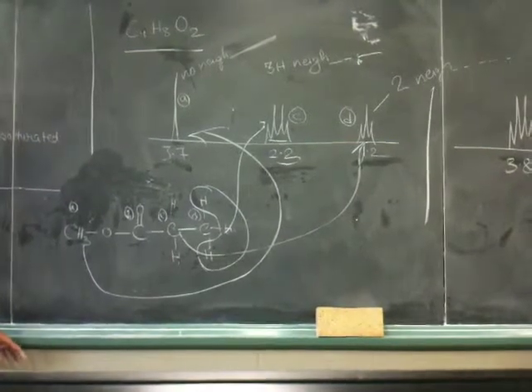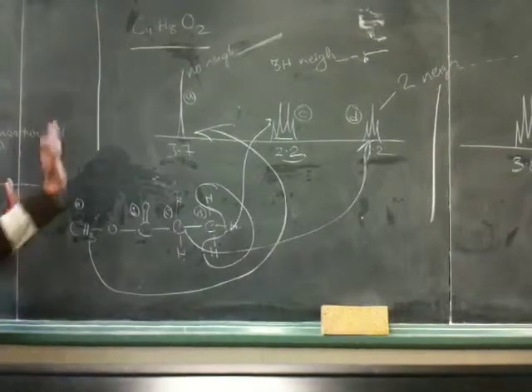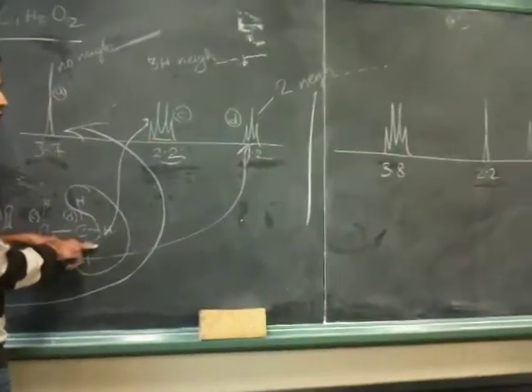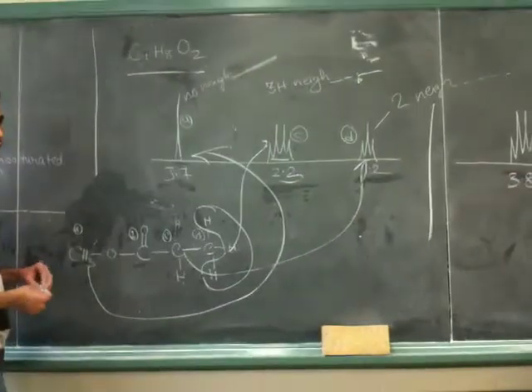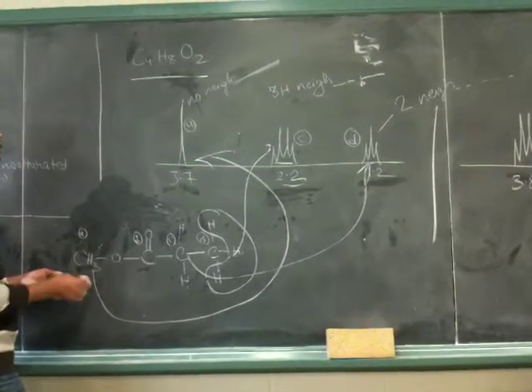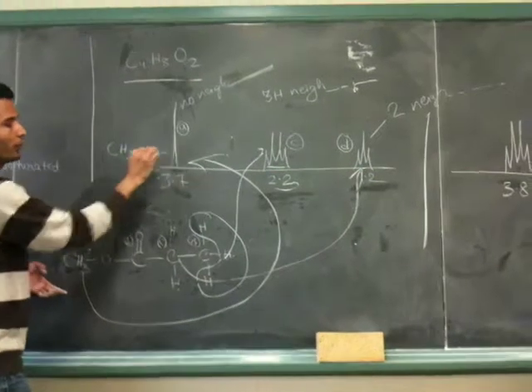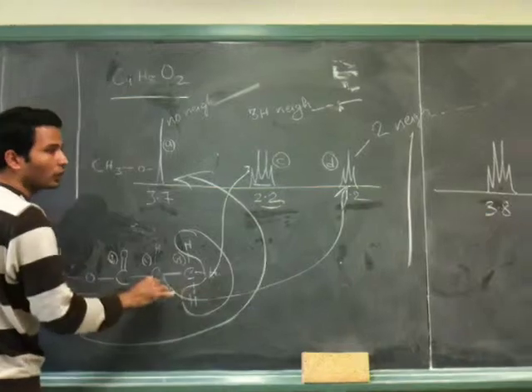Can't you just put CH3 on top or something? This one is a CH3 here, and this one is a CH3 here. Which CH3 do you mean once you write CH3? Which CH3 should I understand? If you want to write like that, write CH3O. Then I will understand you are talking about this one, not this one.